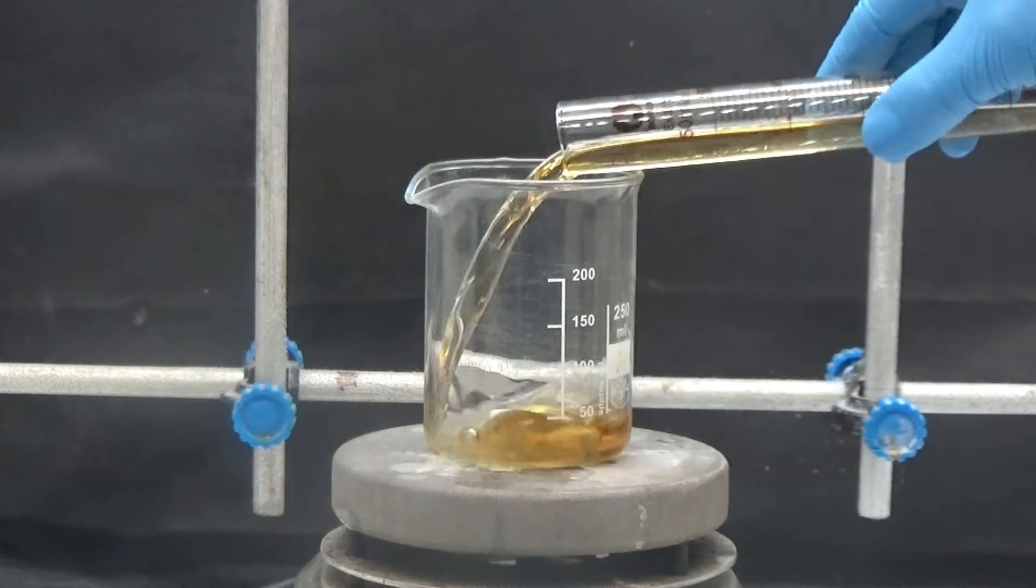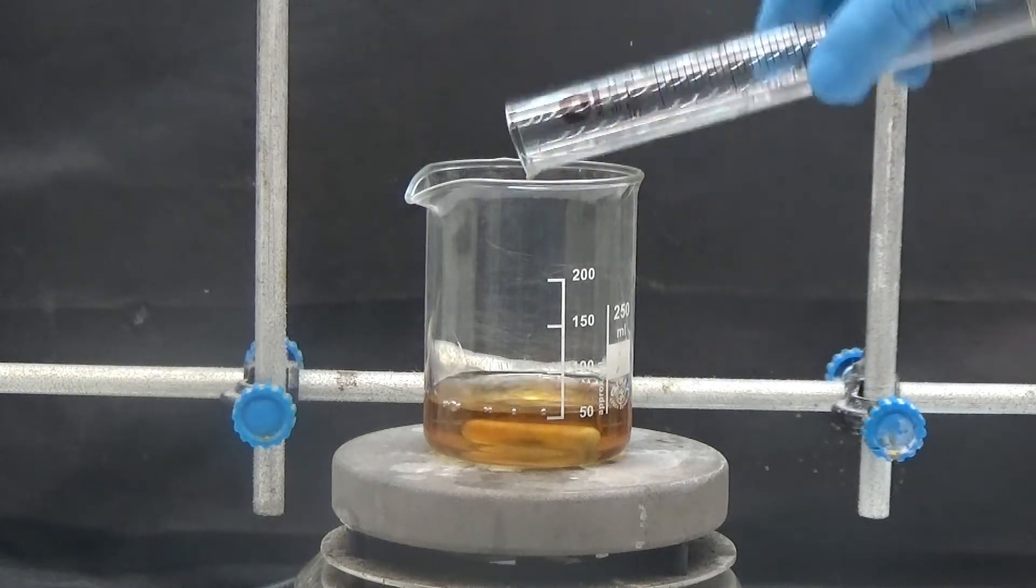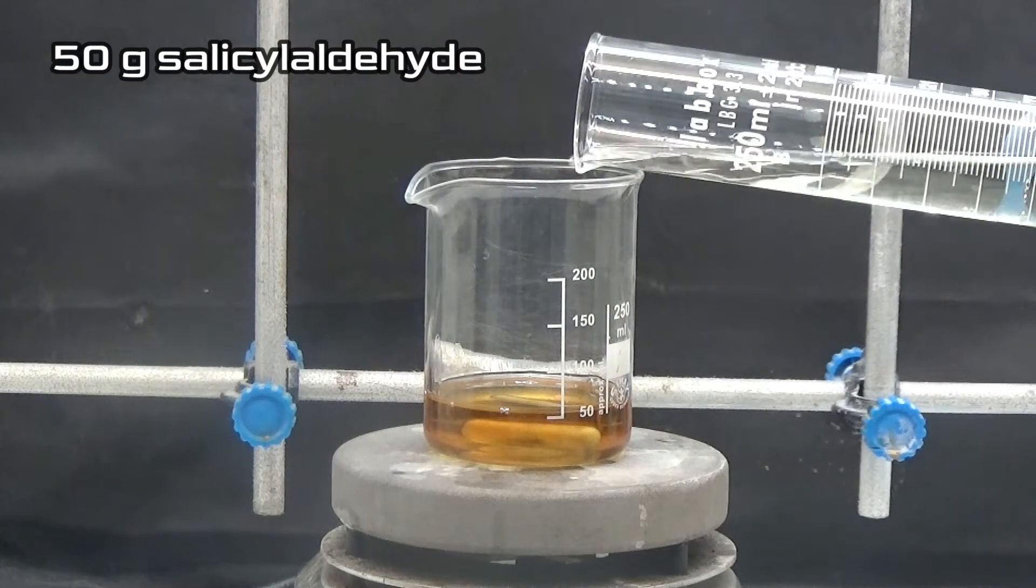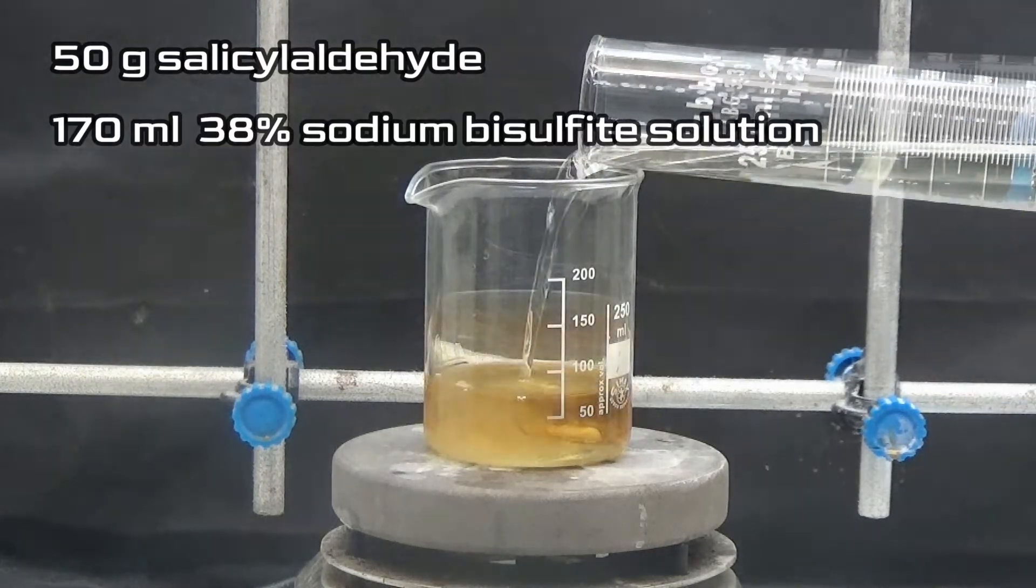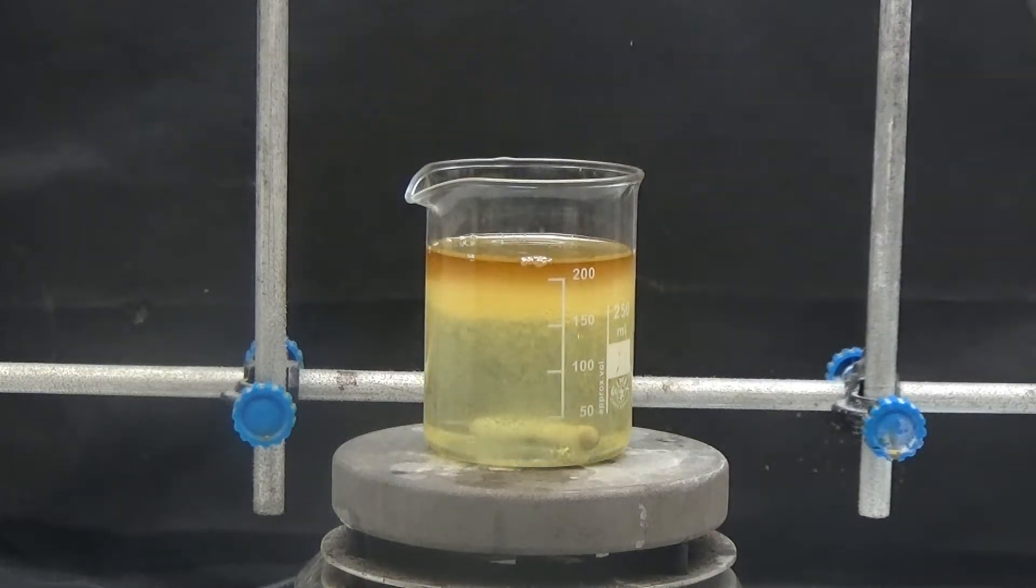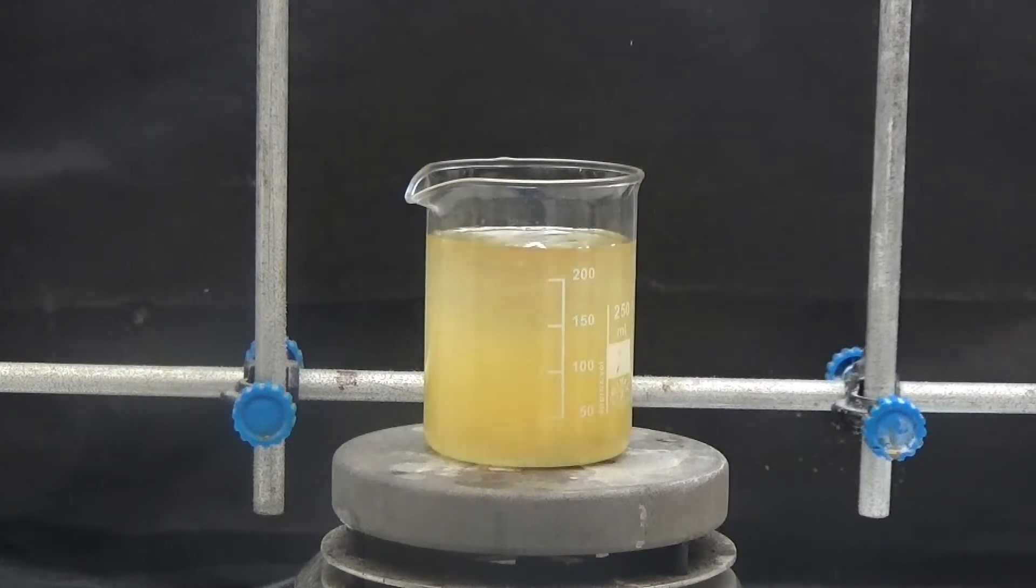The first thing we are going to do is purify the salicylaldehyde using the sodium bisulfite method. We put 50 grams of salicylaldehyde and 170 milliliters of 38% sodium bisulfite solution in a 250 milliliters beaker. Keep stirring vigorously for 40 minutes.